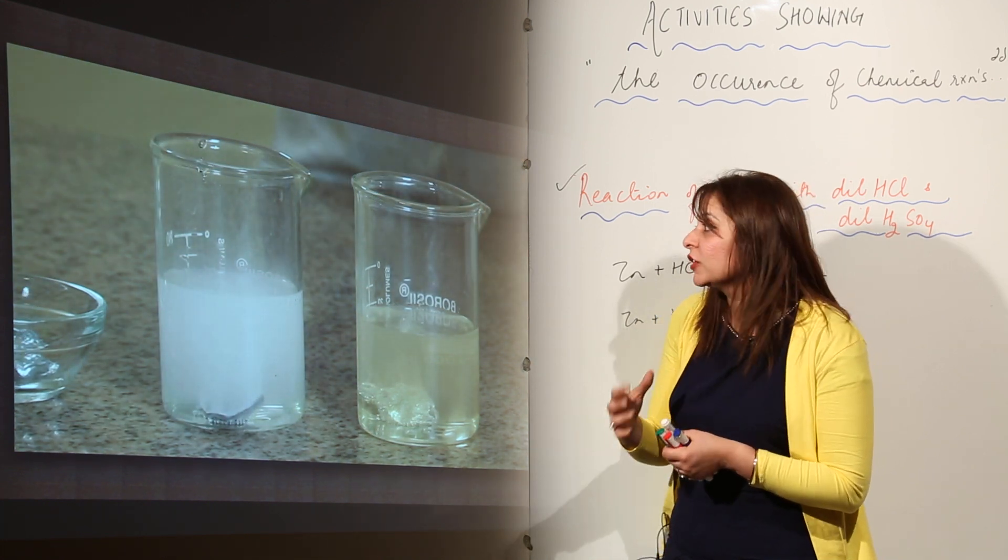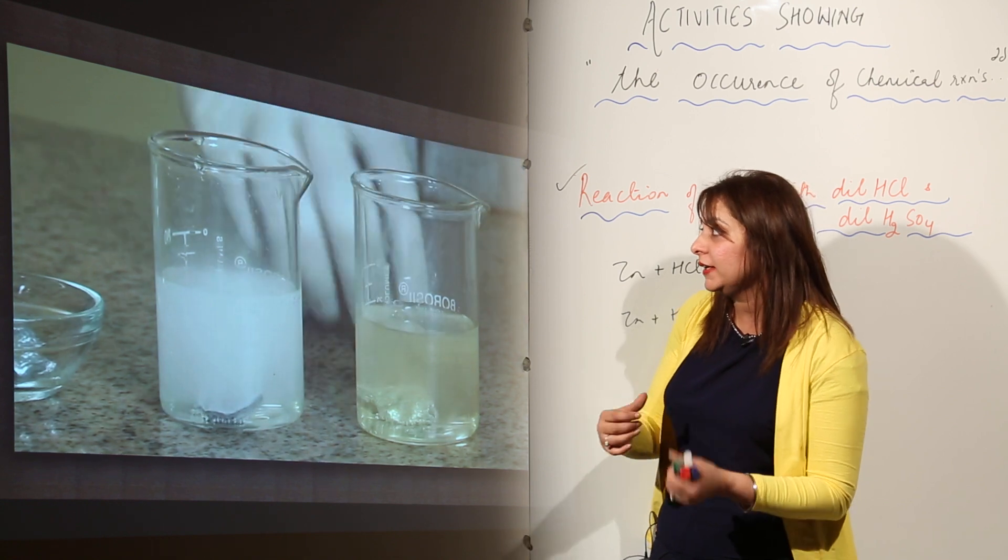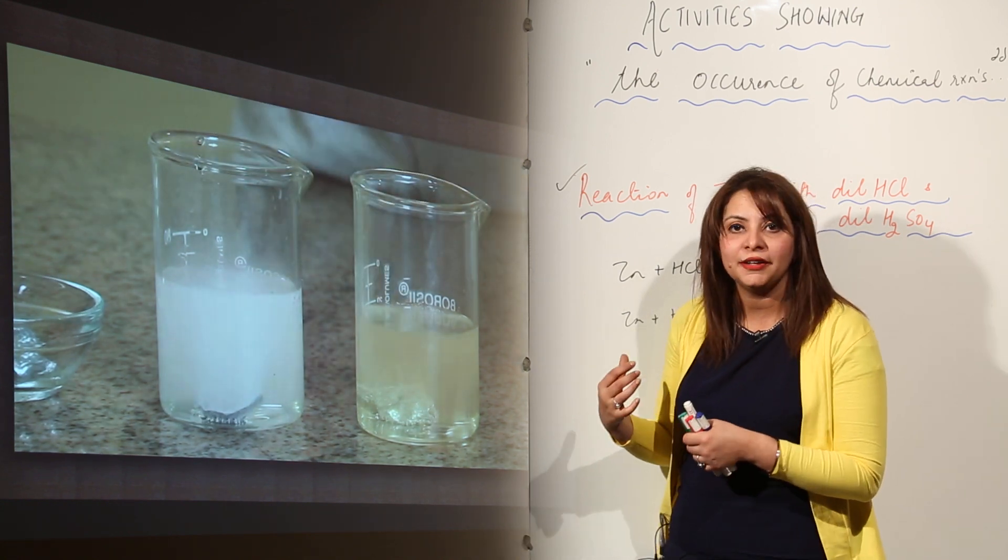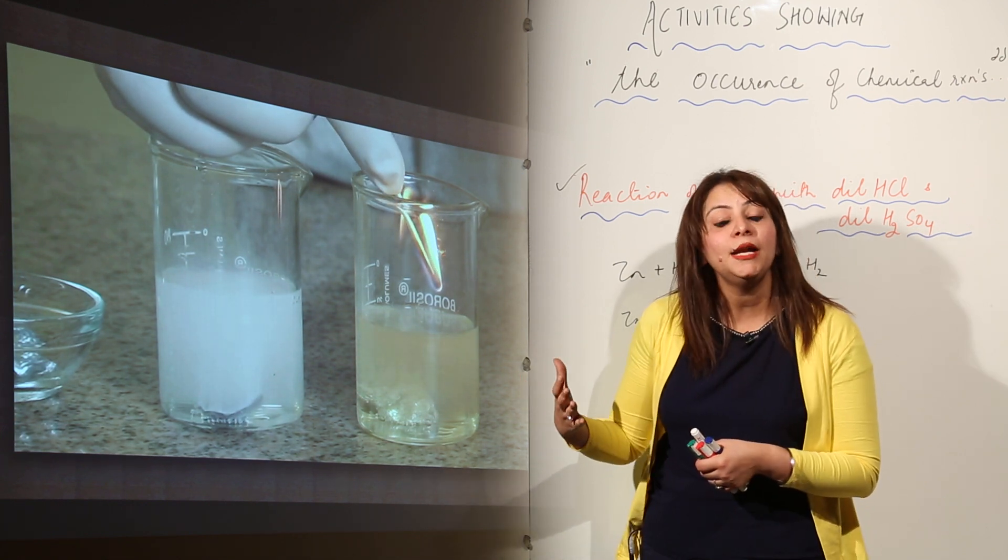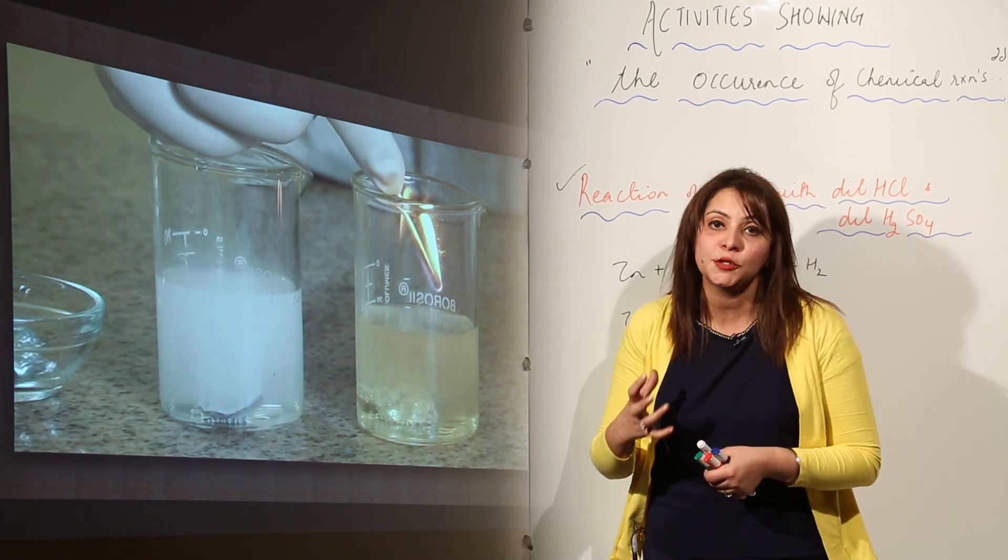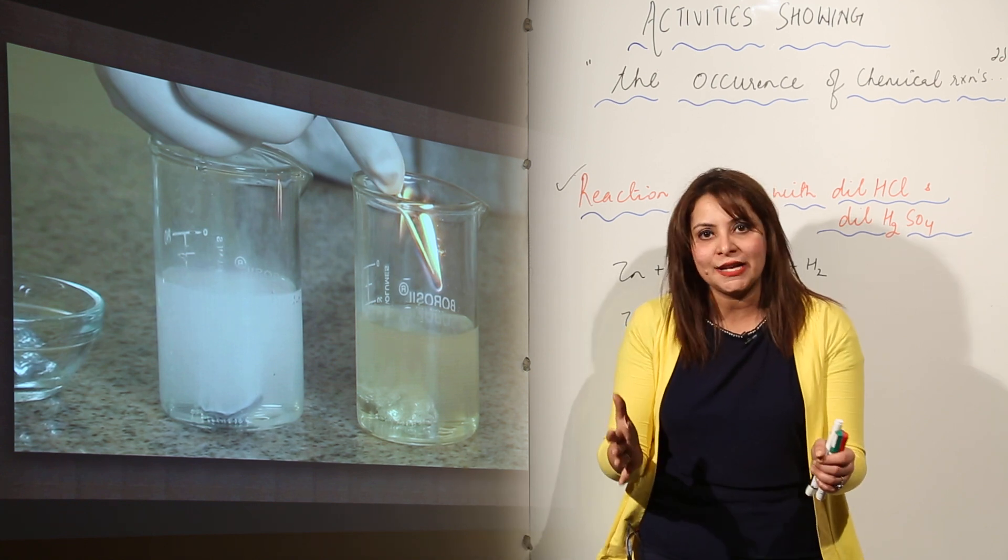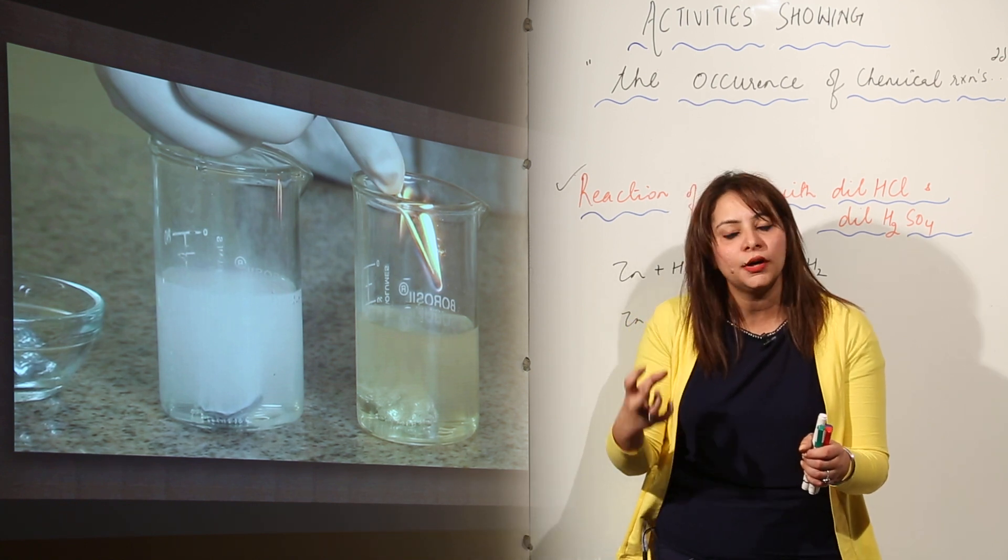Again we bring the match stick in the another beaker. The same thing is going to happen. See, again it burns with the pale blue flame with the same sound, that is popping sound.